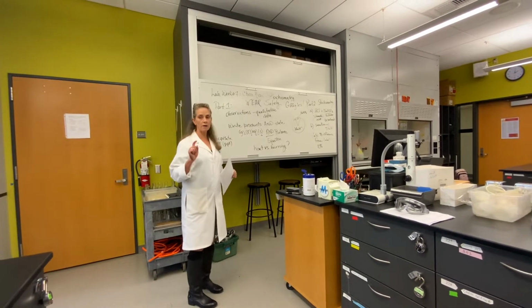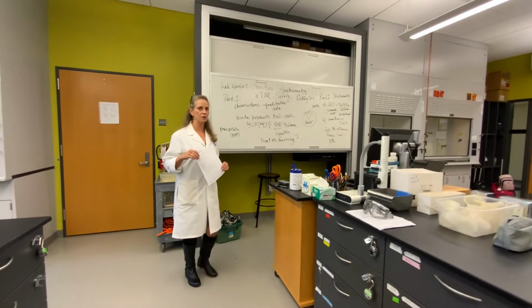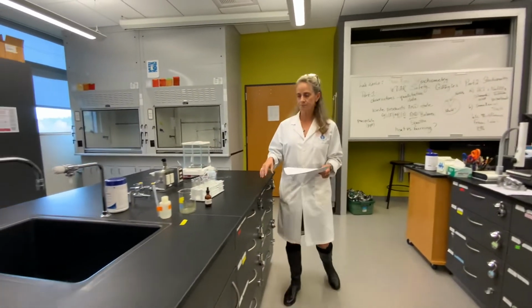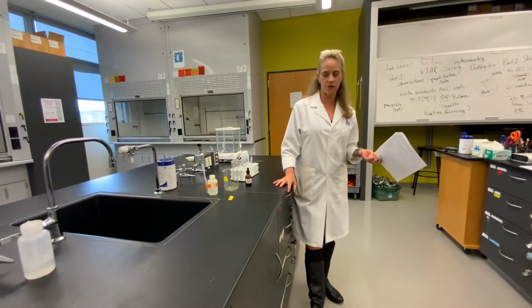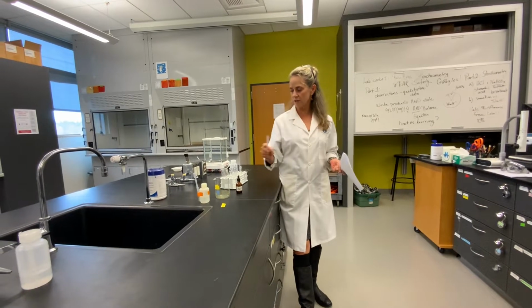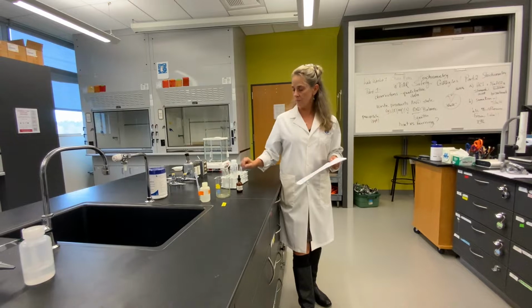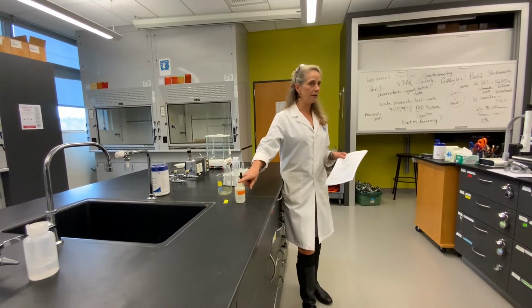Okay, so I'm gonna walk around and just kind of identify all the 7 reactions really quick and give you cautionary measures and that sort of thing, all right? So first reaction, I've actually changed it in the lab, so I don't know if you got the newest version or not. You're gonna utilize these test tubes, so you don't have to clean, you do have to clean them when you're done, and they just go back in here, but you don't have to put them back in your drawer. So you're gonna add, for the sodium iodide, about 1 ml, okay?